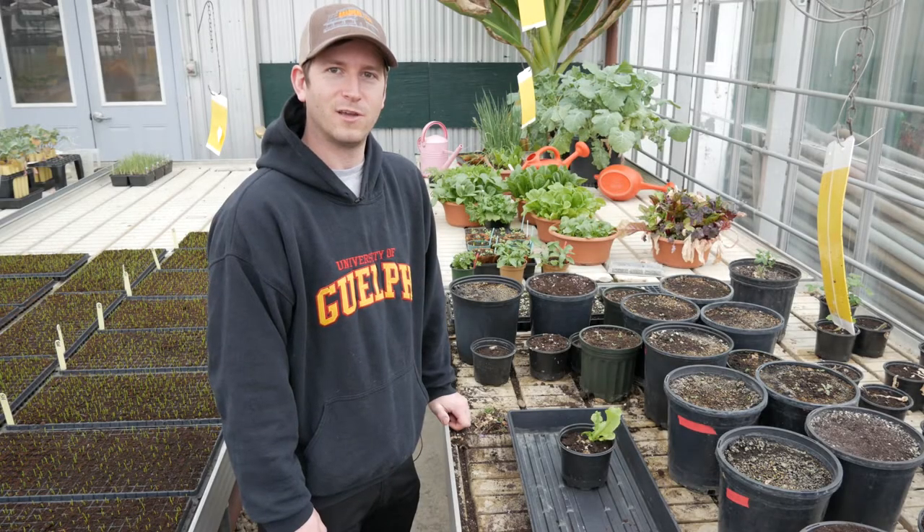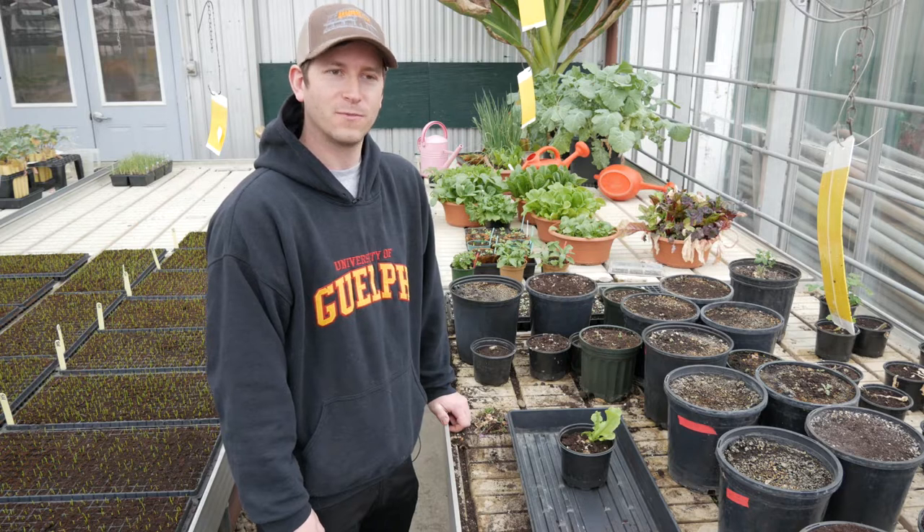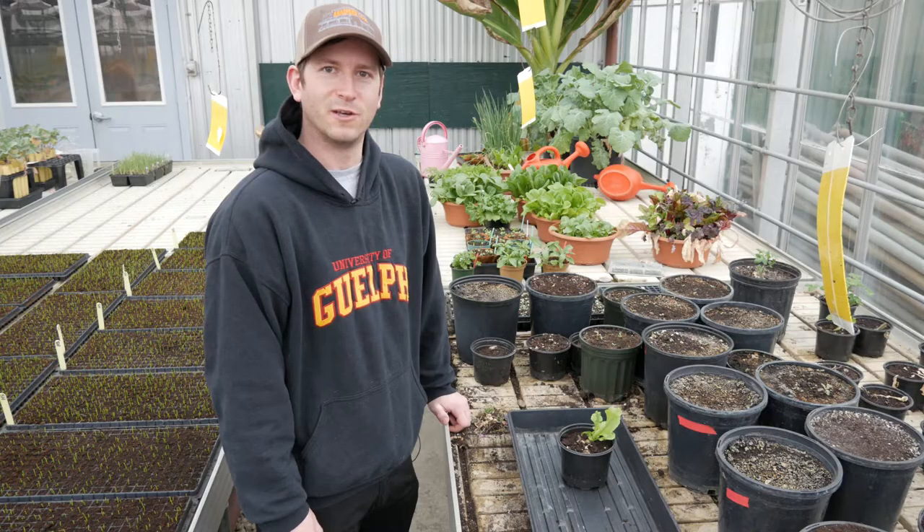Hi everyone, my name is Tyler Blauel and I'm the IPM program coordinator here at the Ontario Crops Research Centre in Bradford. Today we're going to show you how to extract root knot nematode eggs from lettuce and tomato roots.